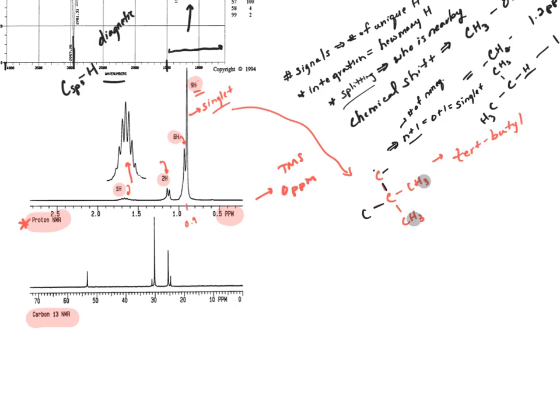And I'm going to go ahead and get rid of this. Make it back to this. And then we'll highlight this guy. Right? So that's number 1. That's a piece. And with all of this stuff, what I'm trying to do here is make pieces that I'm then going to stitch together to make sense of the rest of the spectrum. Now, what's nice about a tert-butyl group is that it essentially terminates a molecule, right? So one of our ends is this thing because this can't go anywhere else. Nobody else can make more bonds, so this is going to be one end of our molecule.